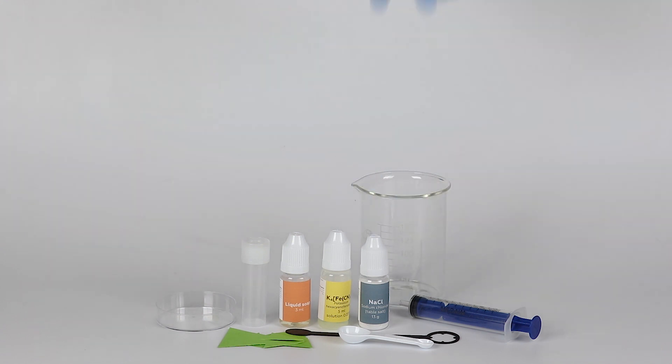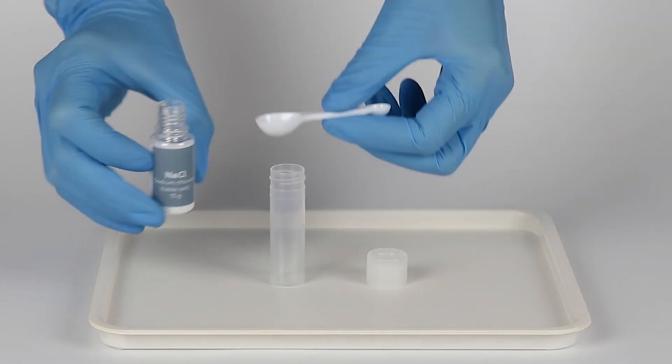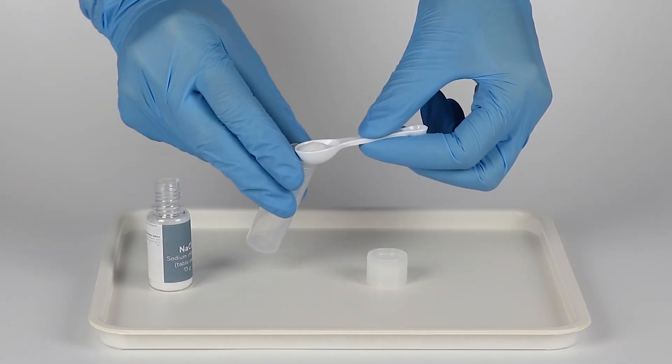Take a beaker from the starter kit and prepare some cold and hot water in advance. Add two big measuring spoons of sodium chloride to the plastic vial.